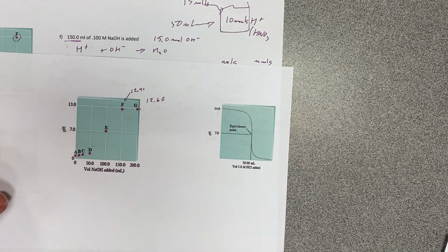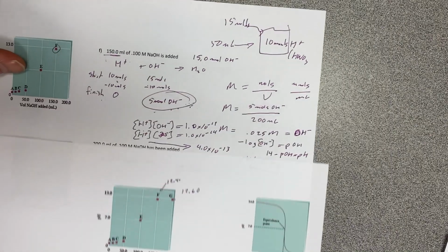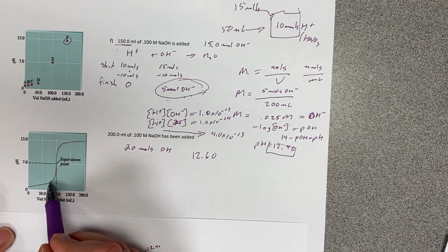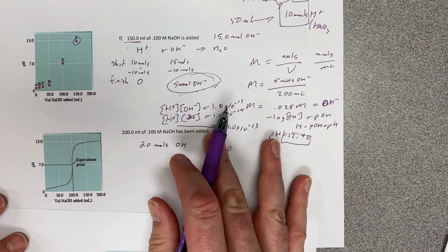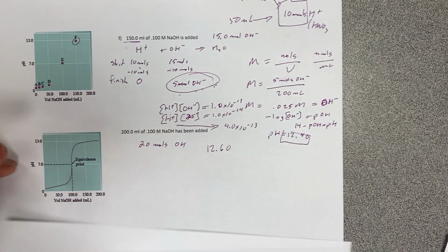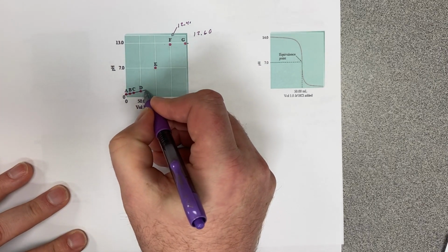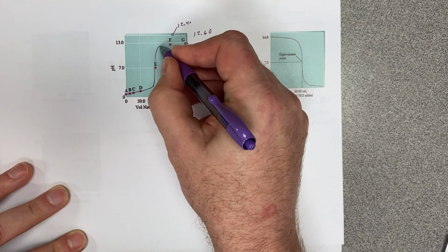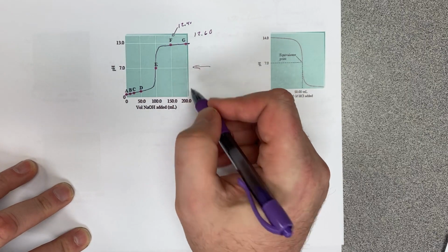Now, how do we actually make a graph? Because you aren't doing a connect the dots. We actually do a kind of a fluid thing. Now, do you see how the graph here, it kind of goes straight, and then all of a sudden it shoots up, and then it goes over? This is typical of every type of titration. Now, if I were doing connecting the dots here, I would go straight until I got almost to the equivalence mark, and I would shoot up until I get almost to the end, and then I'd even out. And that is your typical titration curve.